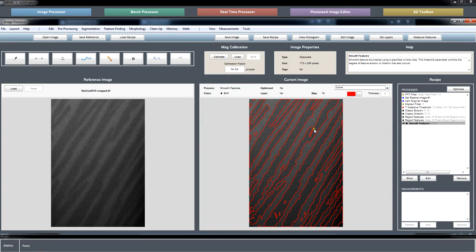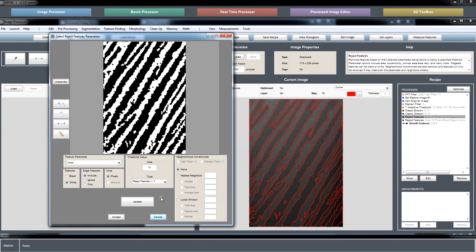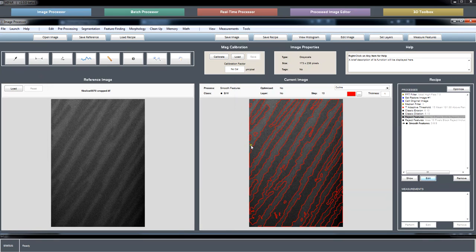And there's our final alpha lath segmentation, where you probably don't want those artifacts either. But this is part of a 3D slice data set, so I don't worry about getting every slice perfect with the recipe. I would apply this recipe as it stands to every aligned slice in the batch processor, and then I would open up the full 3D segmented data in the 3D toolbox, and you could then get rid of any white clusters that are only 1 or 2 slices thick.